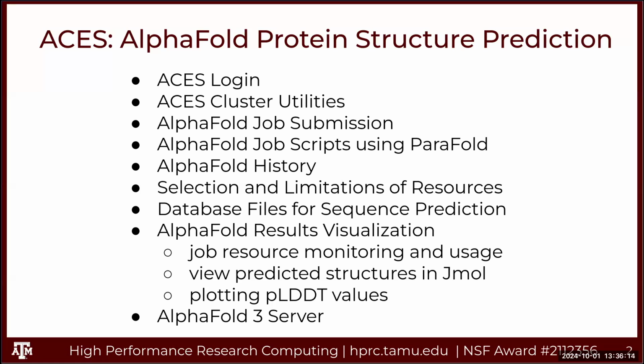A couple other things. We'll look at the database files. We have a shared location. And then we'll look at the output of a job that already completed. And then I'll briefly cover the AlphaFold 3 server.